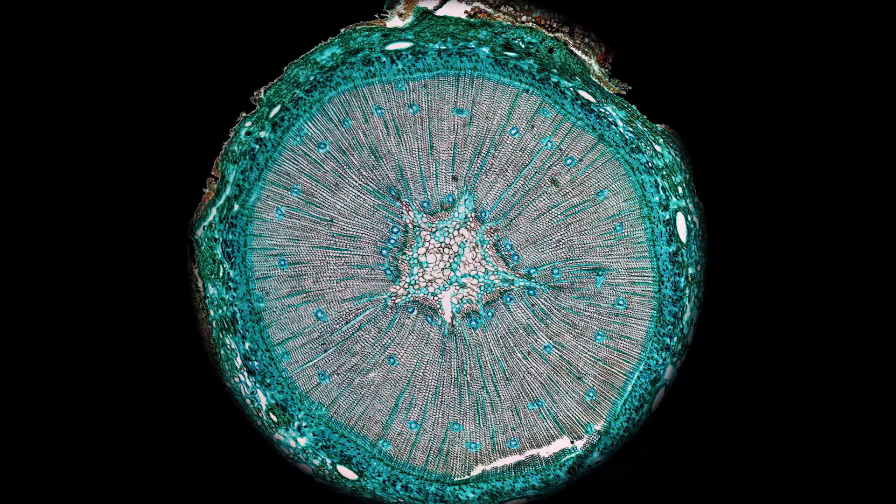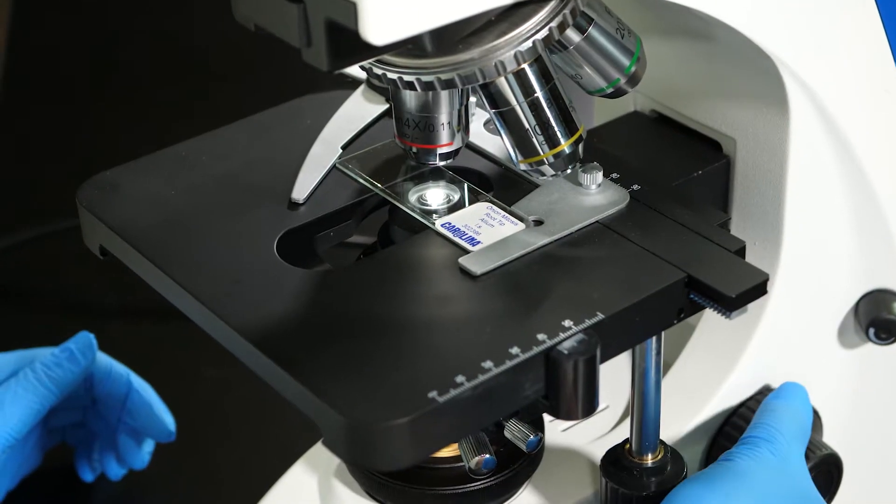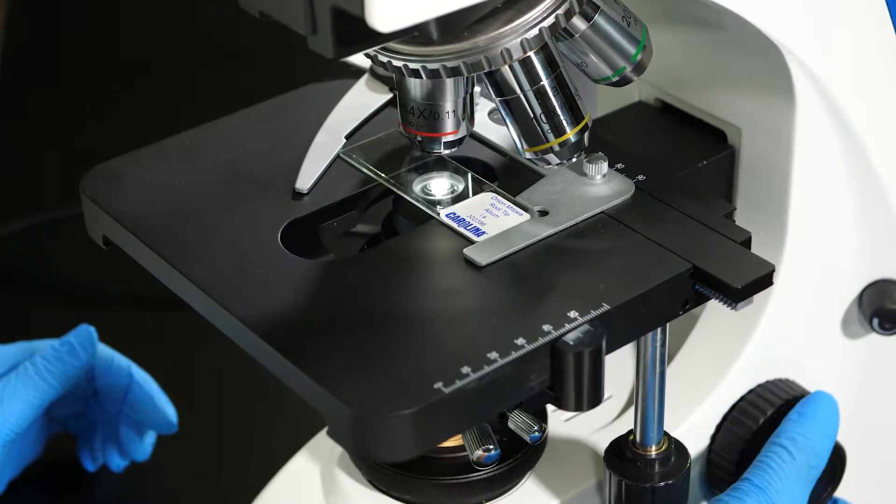Under the scanning objective lens, we can see the layers of this woody dicot stem. Under a higher magnification, we can see individual cells. This is a prepared slide of an onion root tip. In this slide, we can see cells in the process of reproducing by mitosis. Mitosis will be studied in detail in a future lab.